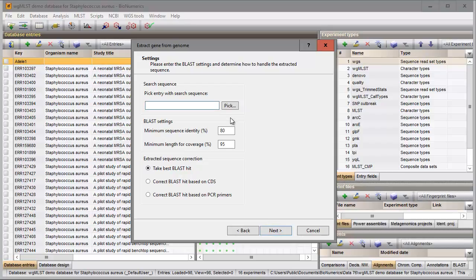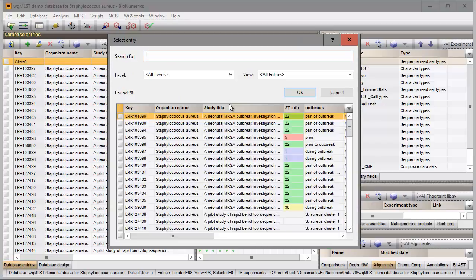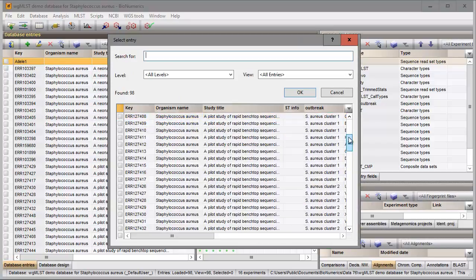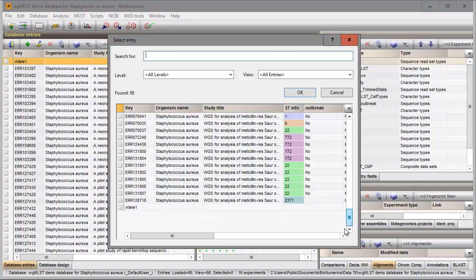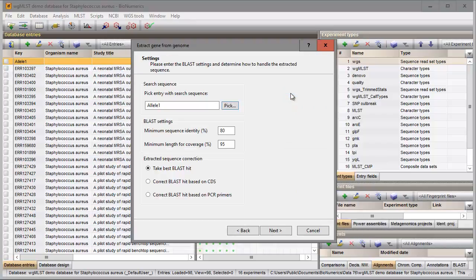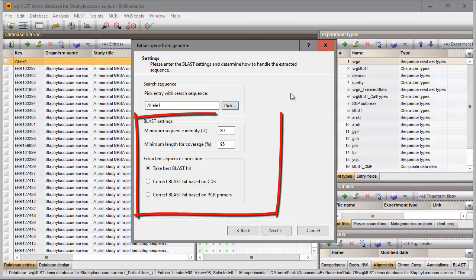In the next step, I select my reference entry from the list of entries in the database. This entry contains the query sequences for each housekeeping gene. I will use the default suggested BLAST settings in this exercise and press next.